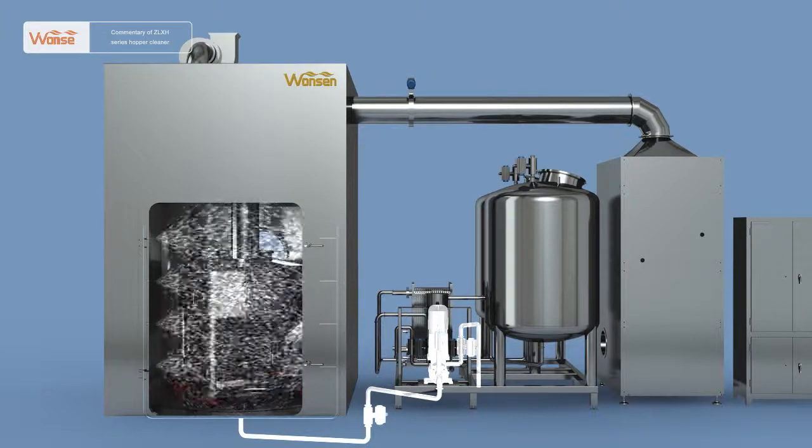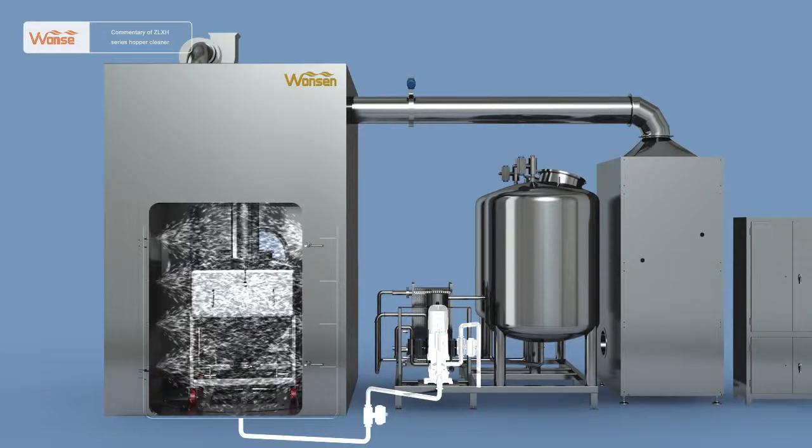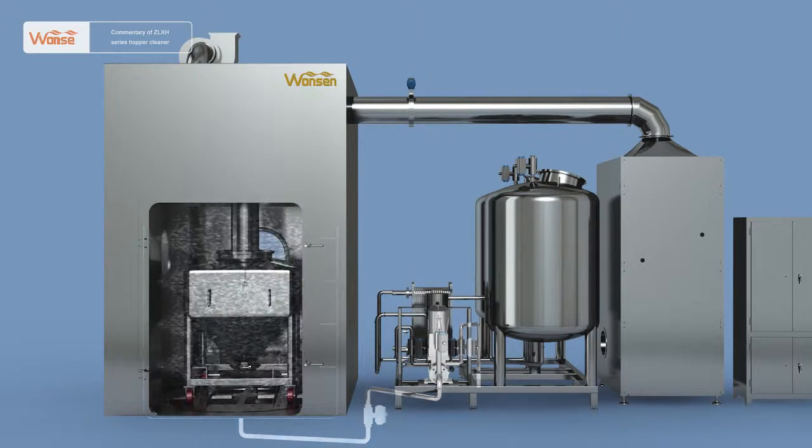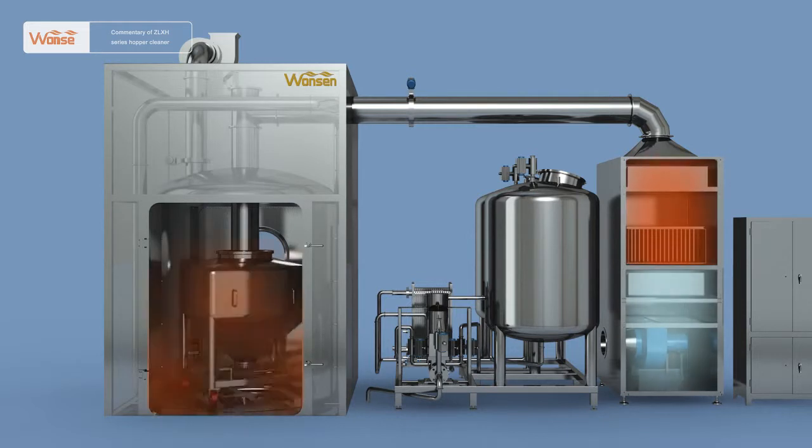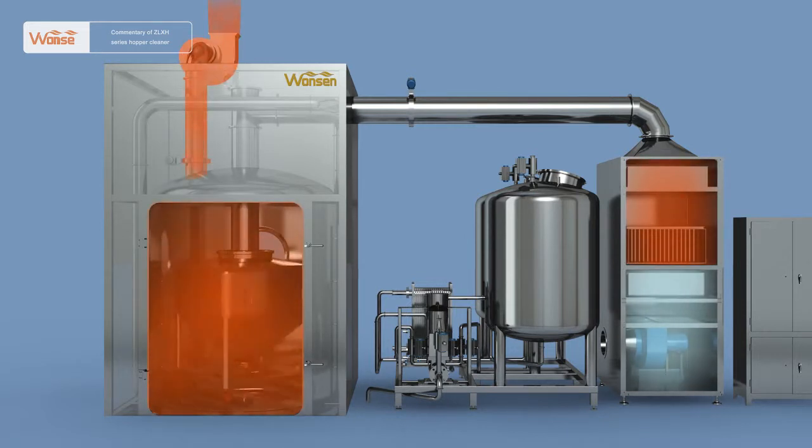After cleaning by the three kinds of water, the transfer hopper has been washed clean. Close the purified water pneumatic ball valve, and after a while, close the water discharge pipe pneumatic ball valve. Start the hot air cabinet fan, open the air pipe pneumatic butterfly valve, and open the exhaust fan and pneumatic butterfly valve at the top to make the hot air in the silo produce convection. The clean hot air produced after the air passes through the fan, medium efficiency filter, heat exchanger, and high efficiency filter will enter the silo to dry the transfer hopper.